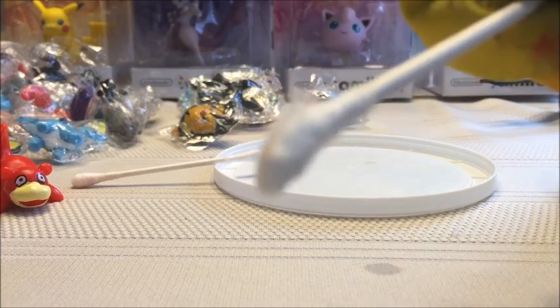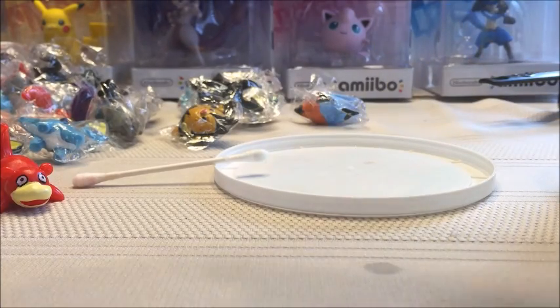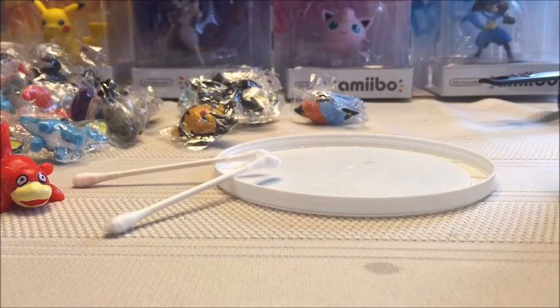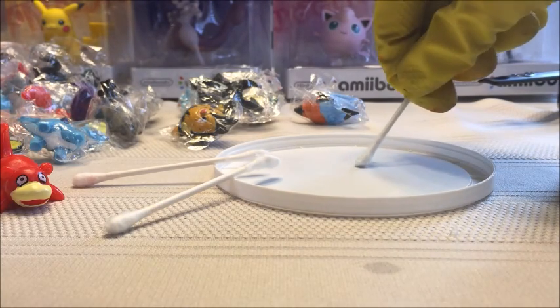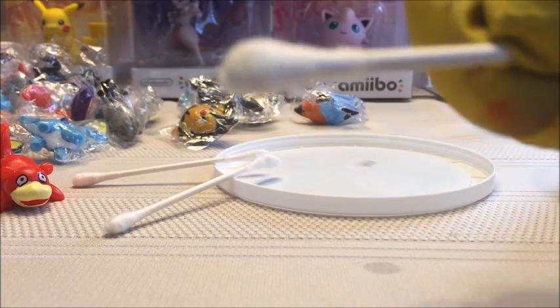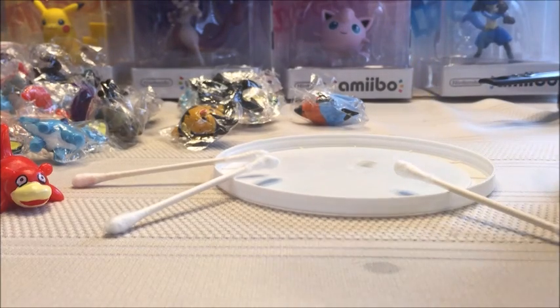It looks like we've got a little bit of blue — only a little bit. Now we've got to do a test to compare the color change of an unused, unswabbed Q-tip, because even if you don't swab it there's going to be a little dab of blue. It's how much of a color change there is that matters.